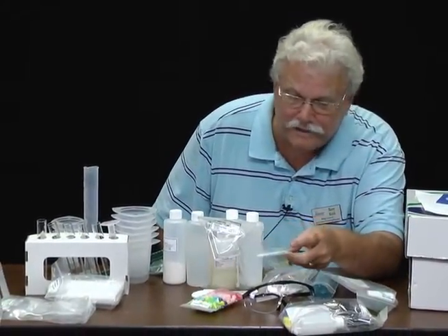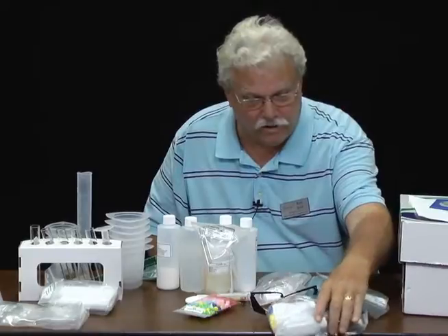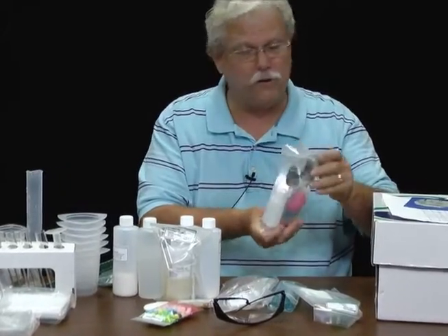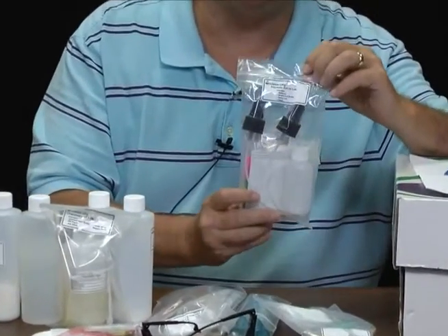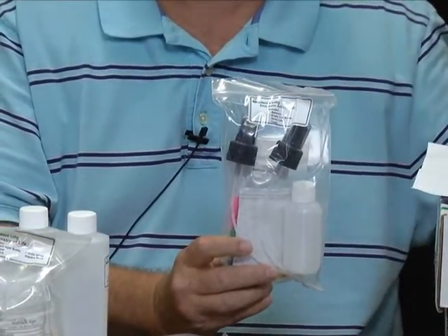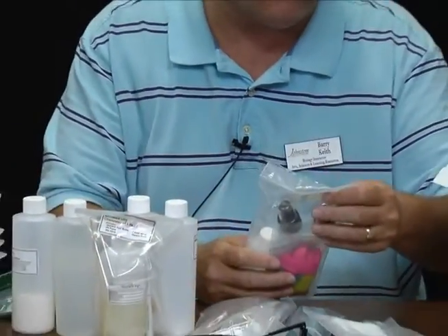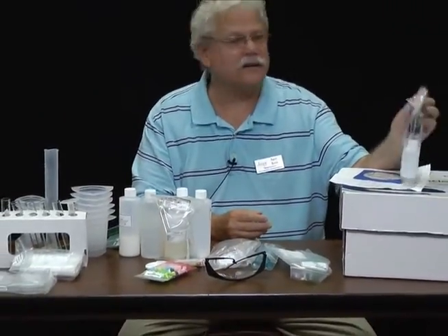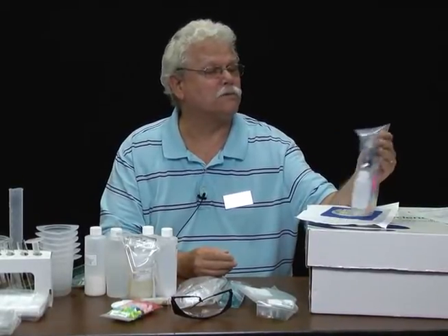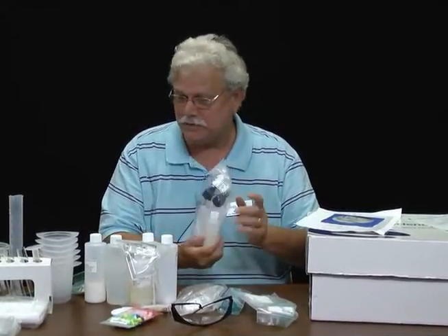Let's see, just sort of randomly going through some other items that you may recognize. You have safety glasses that you can use. And there are other items, and you'll notice that these individual bags, for the most part, have the title of the laboratory that is the same title as you'll find in your lab manual. So instead of having to search for all the different items in different areas, this one, for example, says Enzymatic Activity Lab, and it tells you what's in it: balloons, empty bottles, sprays, yeast. And therefore, you've got living material, such as yeast.